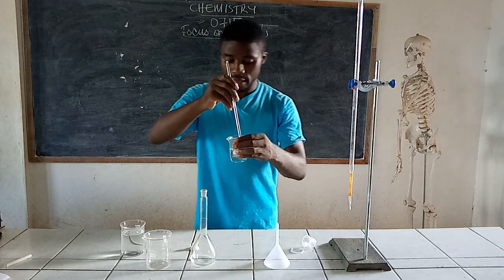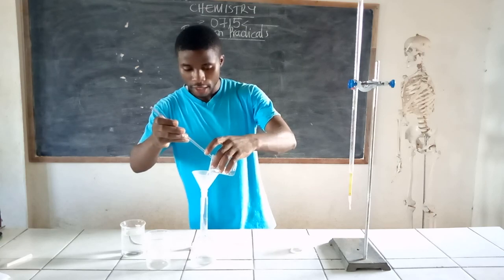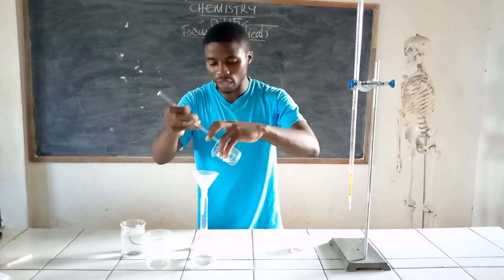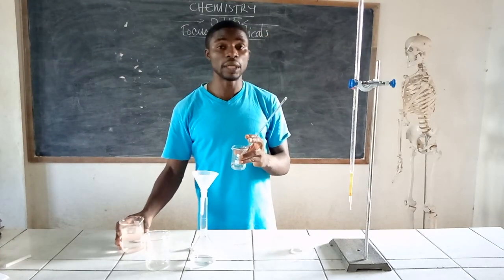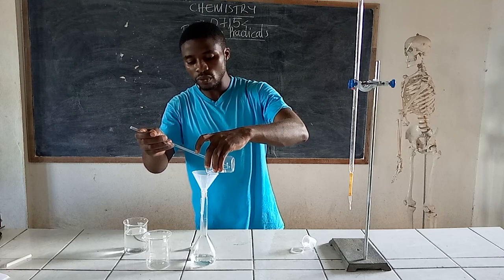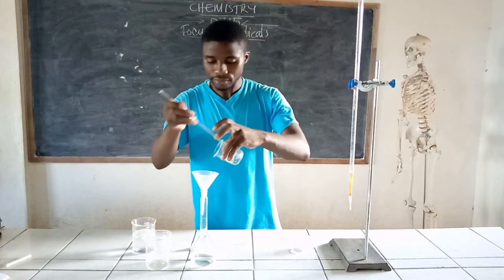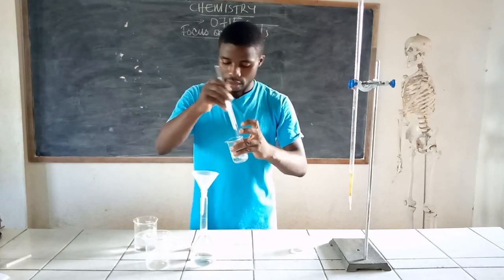Use a funnel and transfer the solution to the volumetric flask. You don't have to wait for all the salt to dissolve in the beaker before you transfer — as part of it dissolves, it can be transferred gradually, taking care not to spill anything. You have to employ precautionary techniques to avoid spilling, because even one drop going out can lead to wrong or faulty results. Rinse the beaker several times and empty your washings into the volumetric flask.